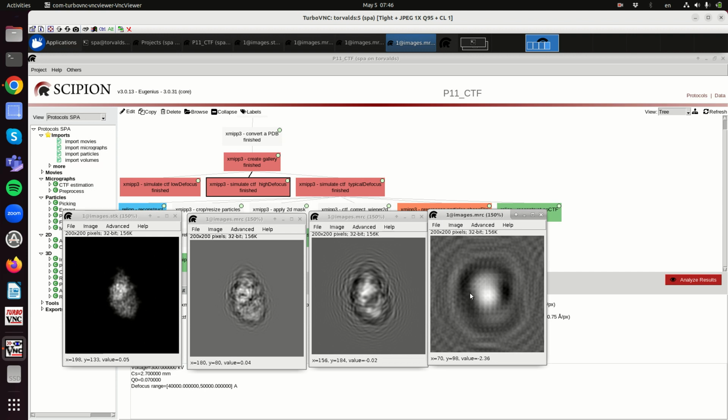This is an artifact of the application of the PSF. In Fourier space, we can fix this by padding. If we increase the size of this image by padding by any number of pixels, these nearby cells get farther and farther, and if you take them far enough, then these ripples coming from the nearby cells will not occur.